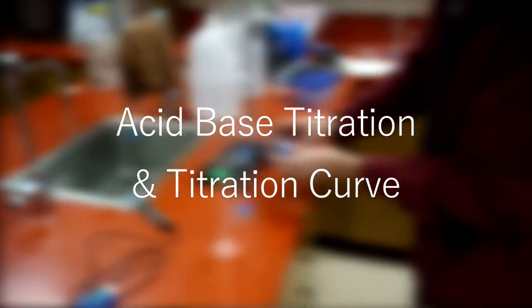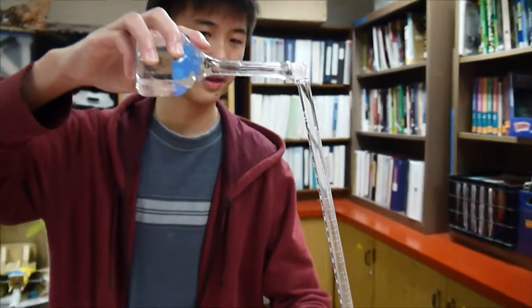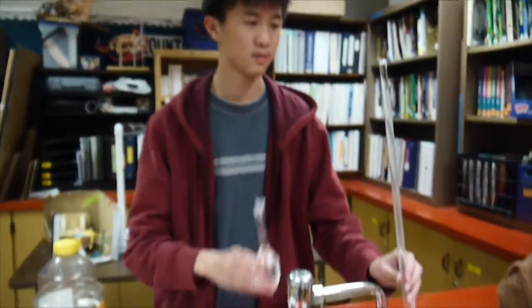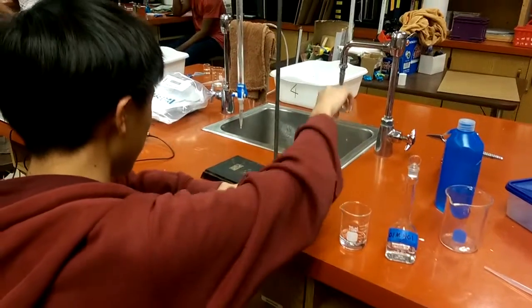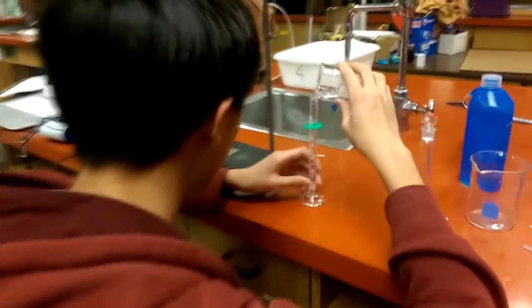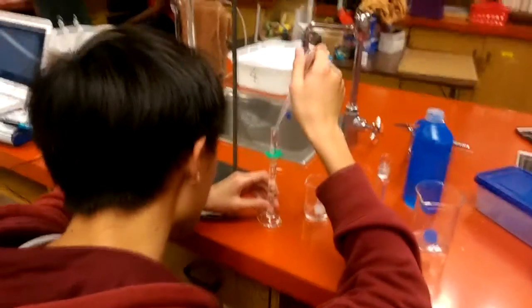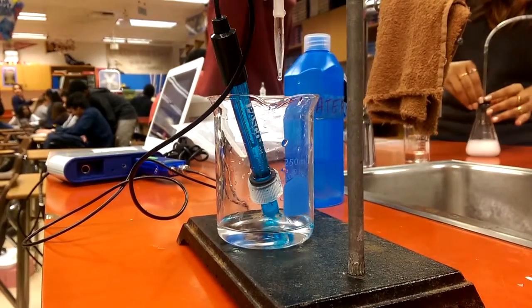Now for the actual titration part. First, make sure all glassware are rinsed off with distilled water. After you dried them, then rinse each glassware respective to what they will be holding. For example, if a beaker will be holding an acid, rinse it with that acid. Before filling each glassware with their respective solution, figure out the amount of analyte is most appropriate, say about 10 milliliters, and predict how much of the titrant, based on the molarities of each solution, is needed to fully titrate the analyte. After rinsing it, now put your pH meter in the beaker and titrate your solution.